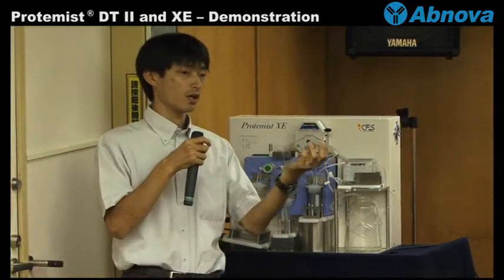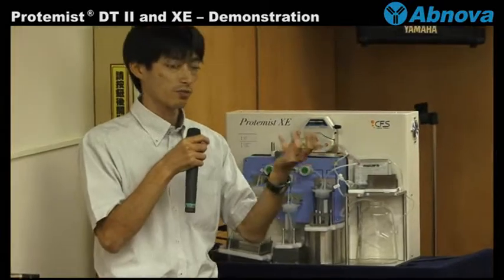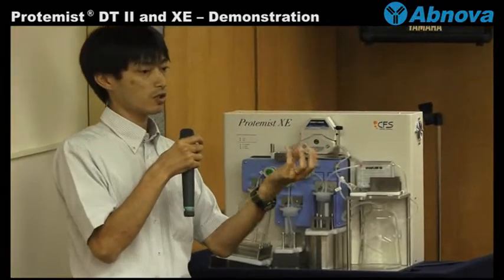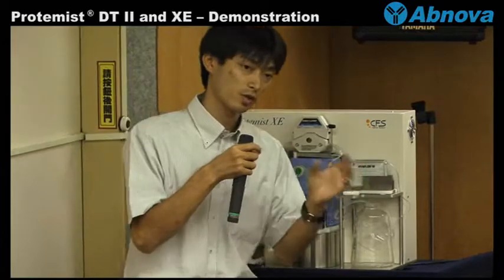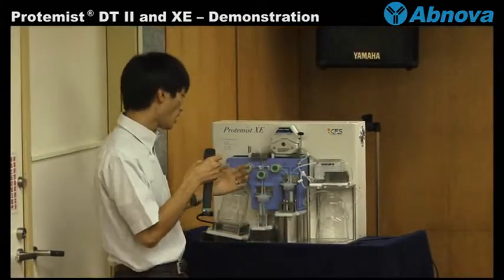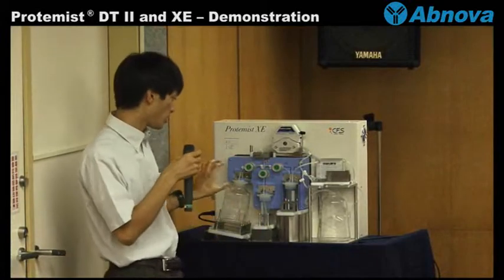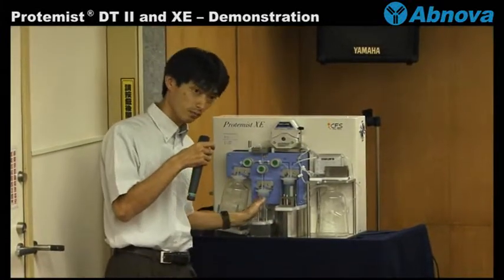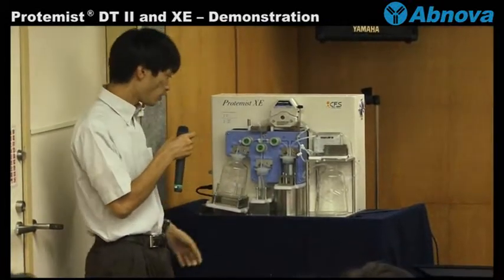the mRNA, the white pellet is precipitated. So that you precipitate the white pellet to simply centrifuge the transcription reaction and recover the supernatant. And the mRNA is prepared into this part.